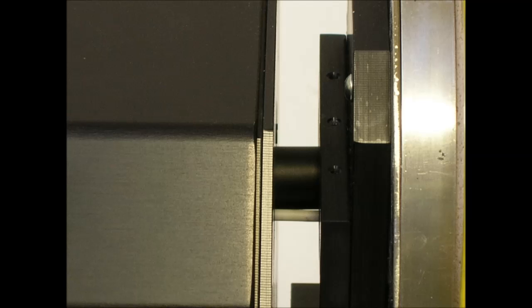The heating microscope MISURA HSML is built with the same technology as the Horizontal Optical Dilatometer MISURA ODLT or the Optical Fleximeter MISURA Flex. There is a large optical bench enclosed inside the black anodized aluminum cage and the blue furnace. The optical bench is connected with the kiln with only one optical path.